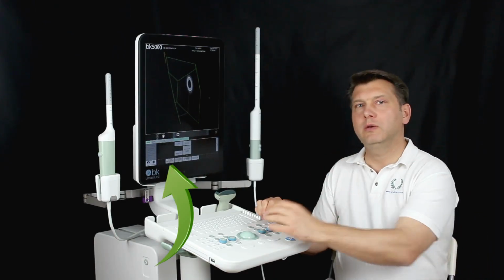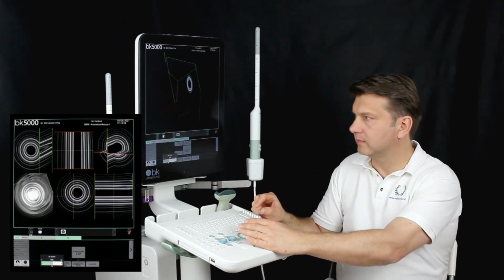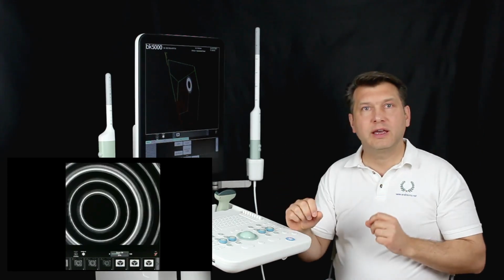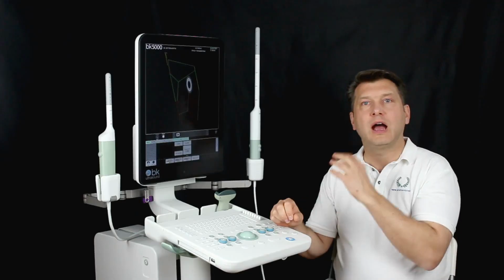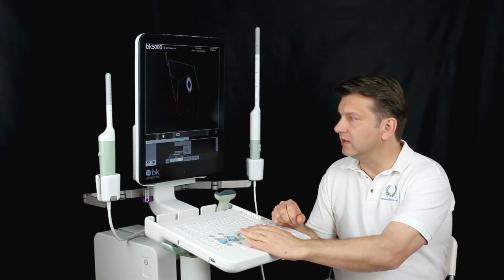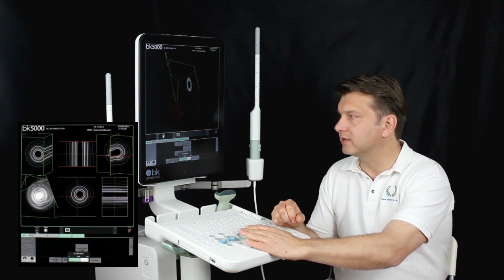To zoom in, we click on this button. Zooming should not be done too quickly, as each surface must be recalculated again. After the box is created, brightness and contrast can be adjusted. The brightness just here and the contrast just next to this.